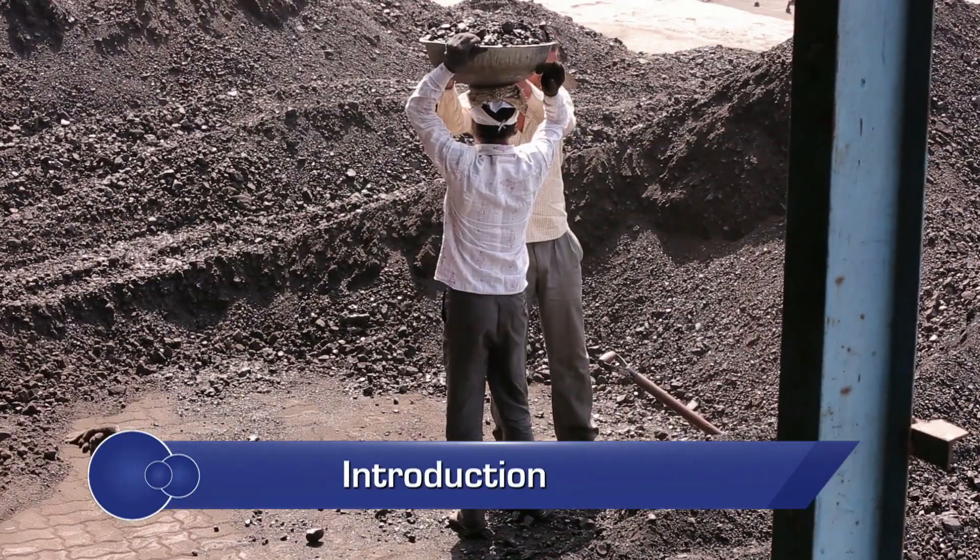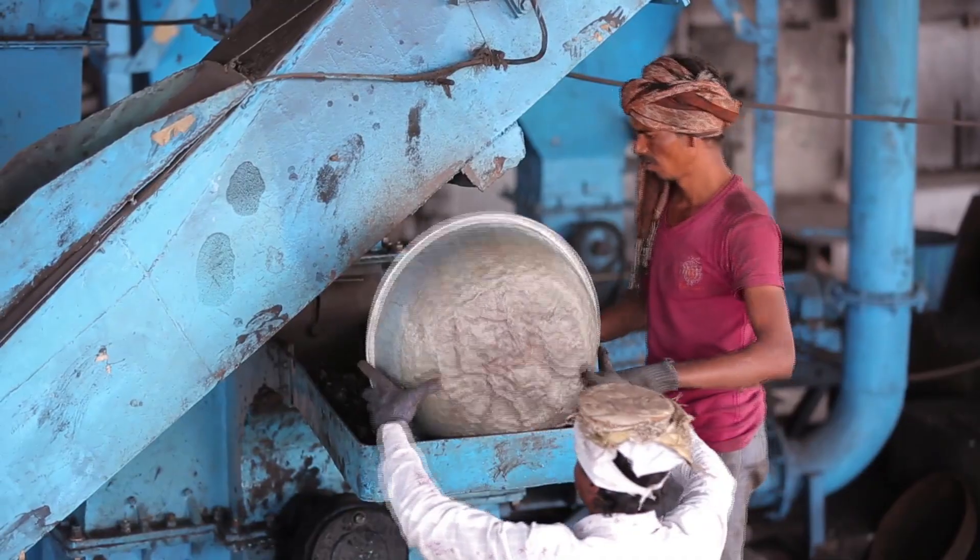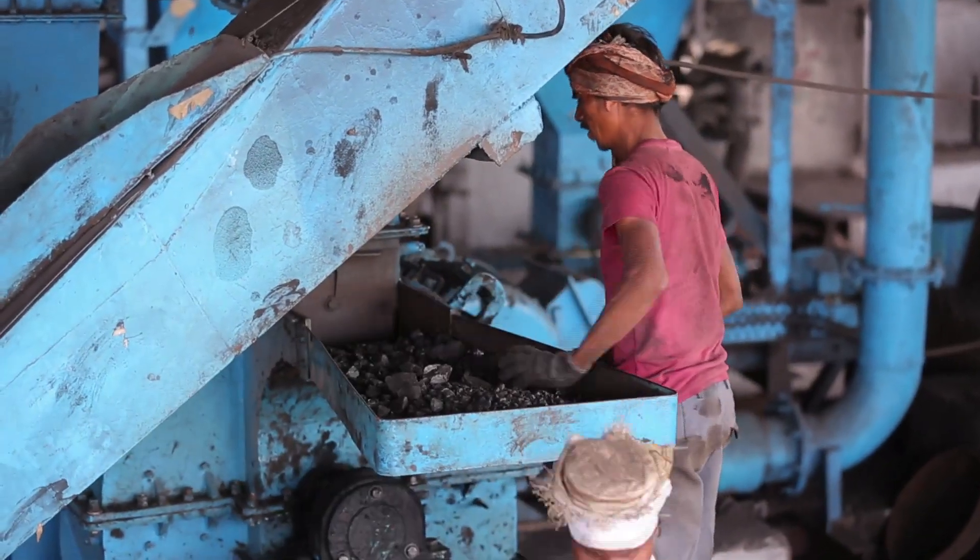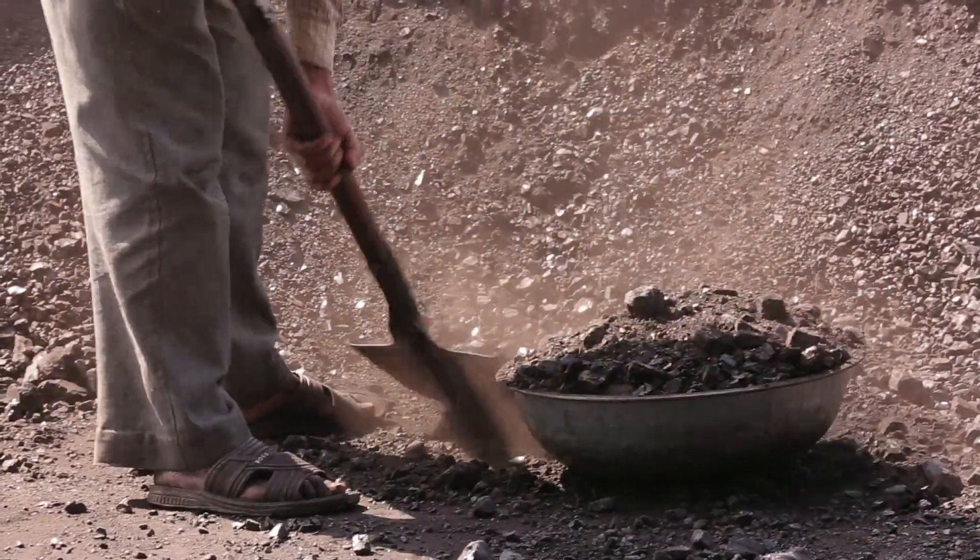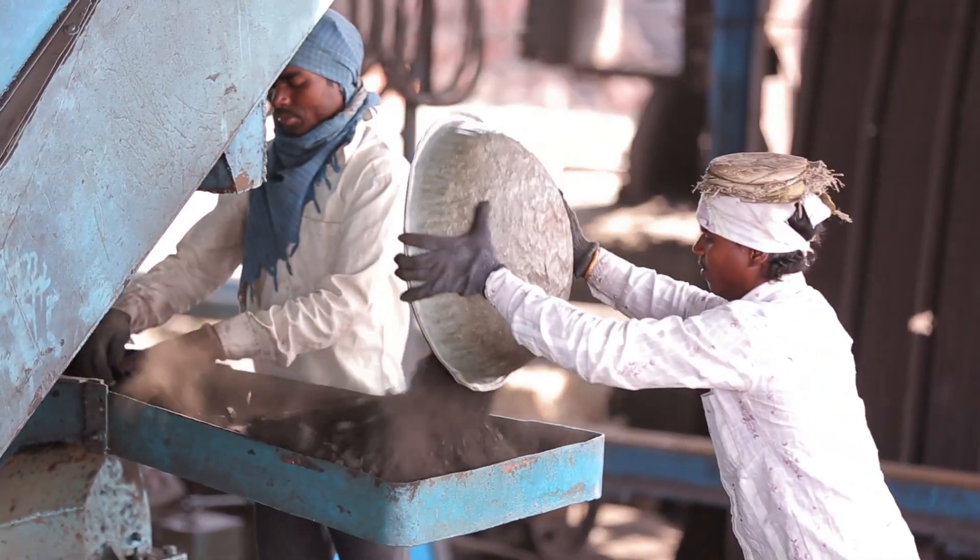Pulverized coal is the fuel used predominantly in reheating furnaces in the steel re-rolling mill sector. Higher the calorific value of pulverized coal, lower is the fuel consumption in the furnace.